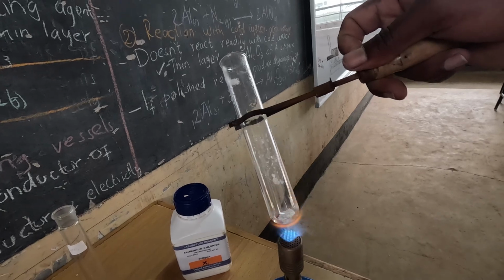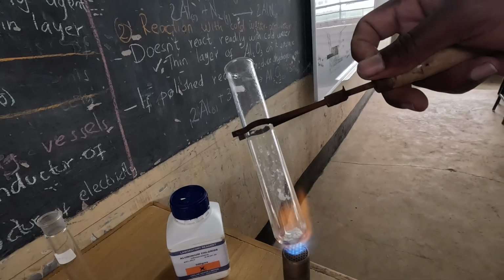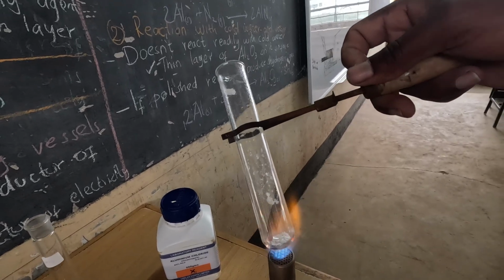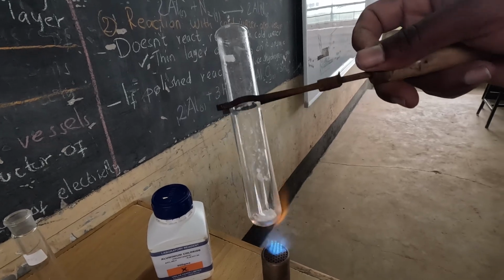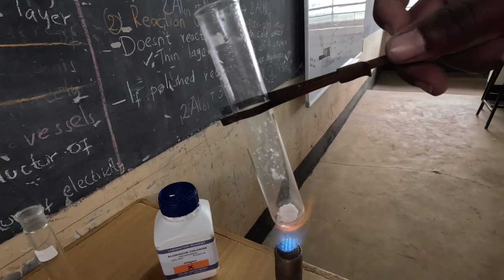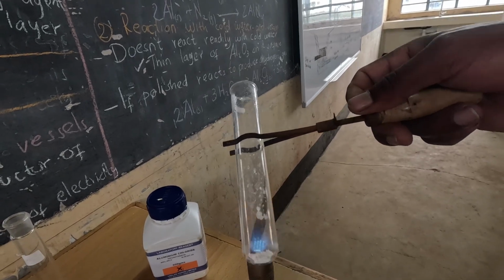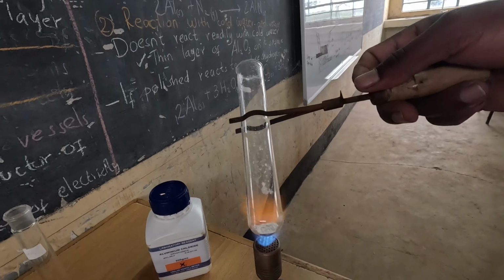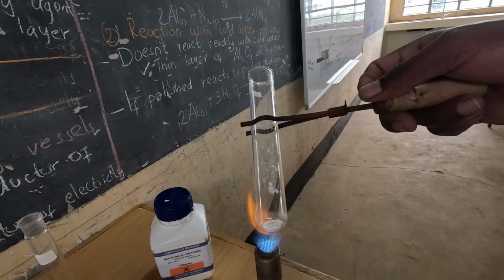If it is heated, it forms white fumes, and these white fumes are going to sublime on the cooler parts of the apparatus, and our apparatus in this case is the boiling tube. And this is the representation that I wanted you to see in our setup today.